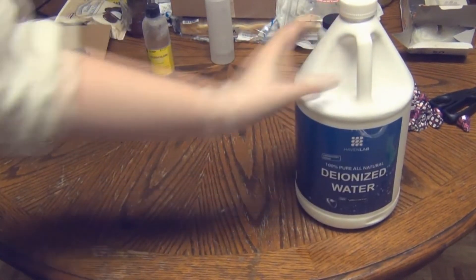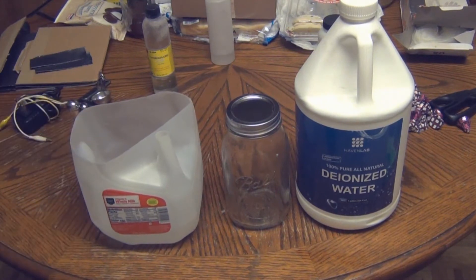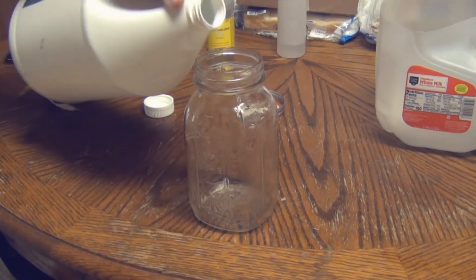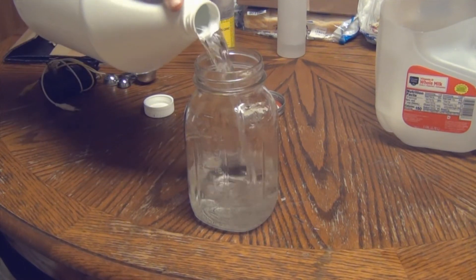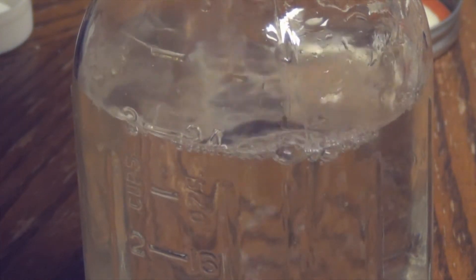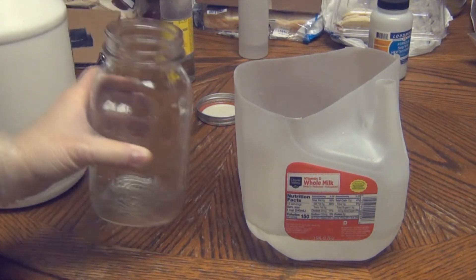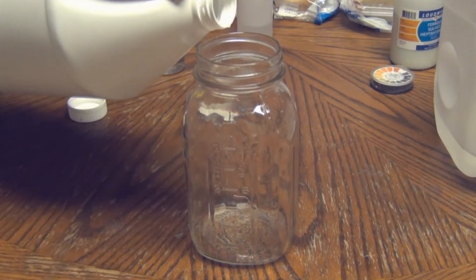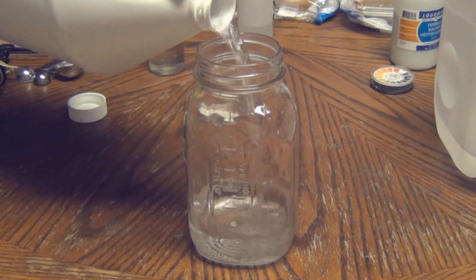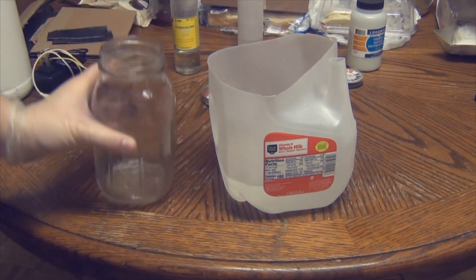Next we're going to need some deionized water, a jar to put our water in, and a large container for our ferrous sulfate solution — I used a gallon milk container with the top cut off. Pour about 24 ounces of deionized water into the jar, then add about 8 more to make roughly a liter, since we're using 15 grams of ferrous sulfate per liter of solution. The measurements don't have to be exact; you just generally need about a liter.